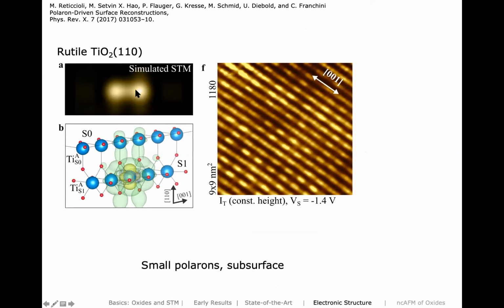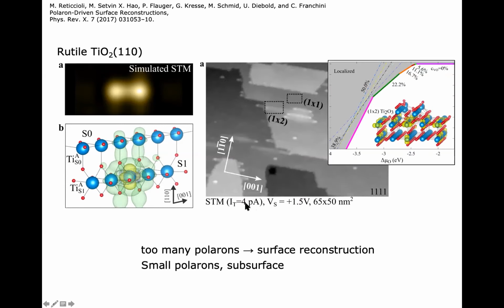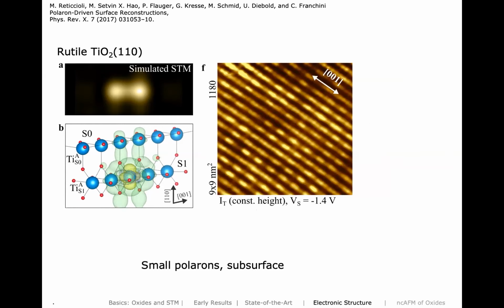This would be a simulated STM image, and this is an STM image in constant height again, going with the STM tip always a half-nanometer tunneling distance in front of the surface. At this particular voltage, you can see minus 1.4 volts, so that's really deep in the band gap, and you can really see this signature of these two dots for the polaron that we have from the DFT calculations.